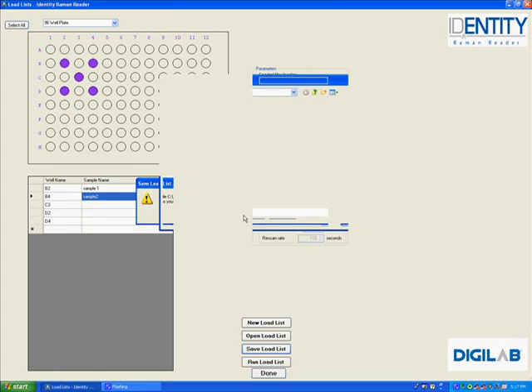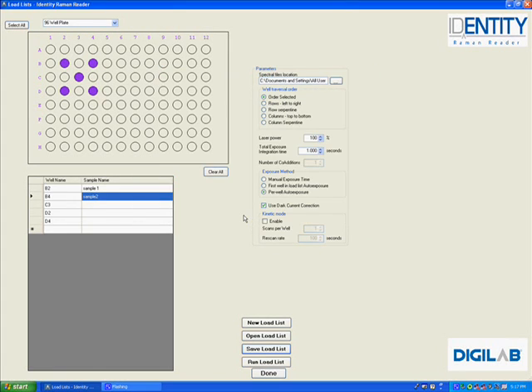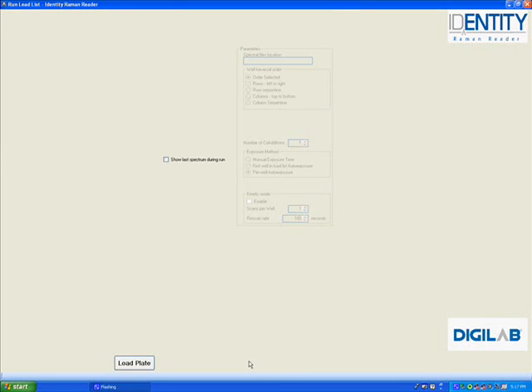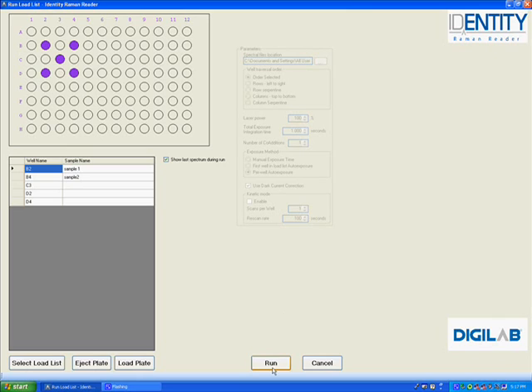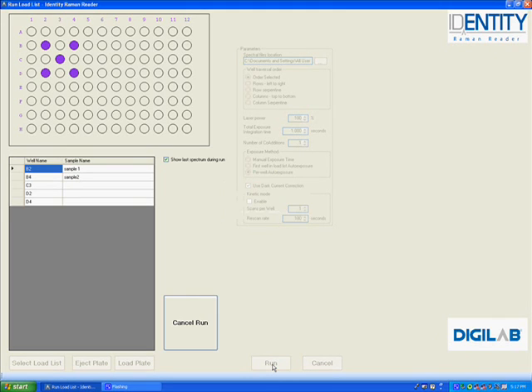Once the plate map view has been selected, I can run it. Select Run. I will select on Show Last Spectrum Displayed and click on Run, and we will now run the particular plate.